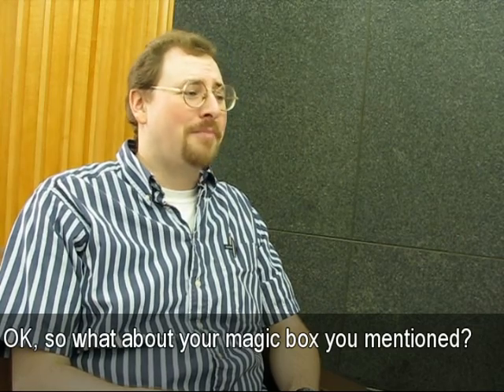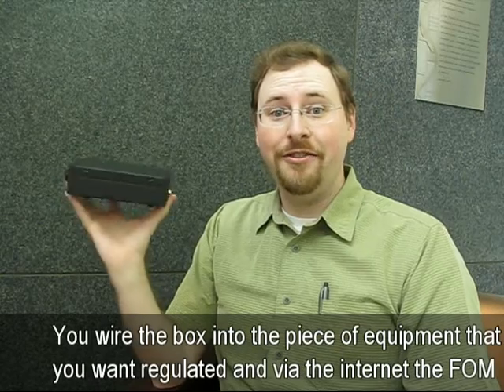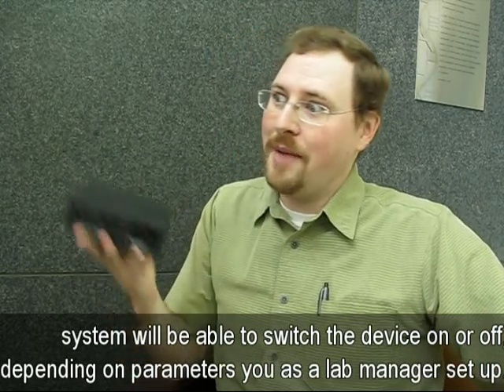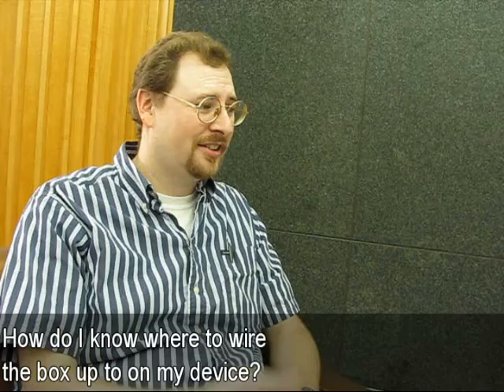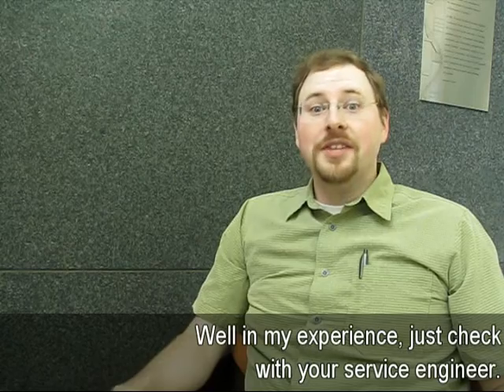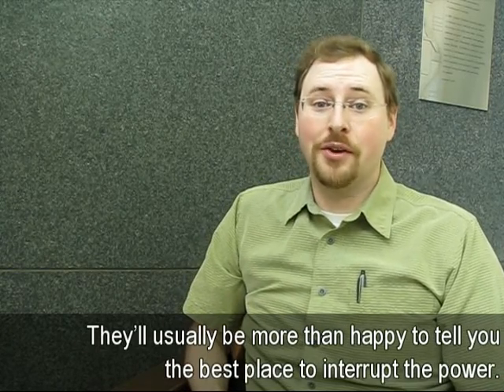Okay, so what about your magic box you mentioned? Well, you wire the box up to a piece of equipment that you want regulated, and via the internet, the FOM system will be able to switch the device on or off, depending on the parameters you as the lab manager set up. How do I know where to wire up the box to my device? Well, in my experience, just check with your service engineer. They'll usually be more than happy to tell you the best place to interrupt the power.